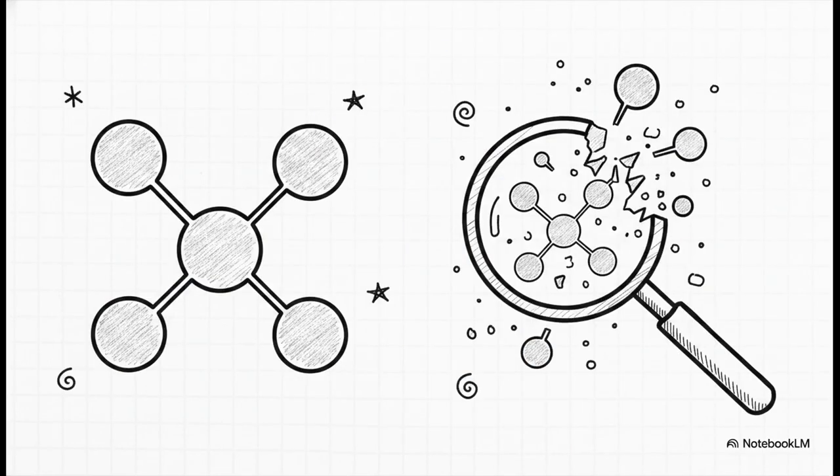Right, so here is the central mystery. We are going to figure out a molecule's exact weight by examining nothing but the shattered pieces it leaves behind after being completely obliterated. I know, it sounds totally counterintuitive, right? But in chemistry, breaking a molecule apart is actually the absolute best way to figure out how it was put together in the first place.